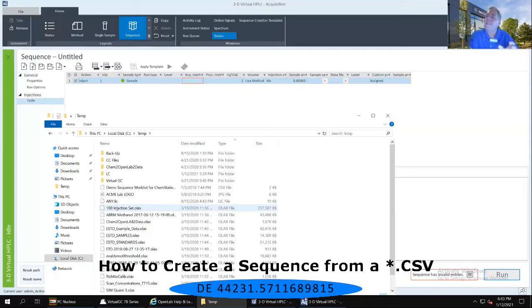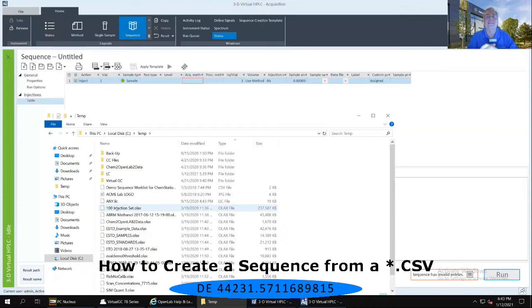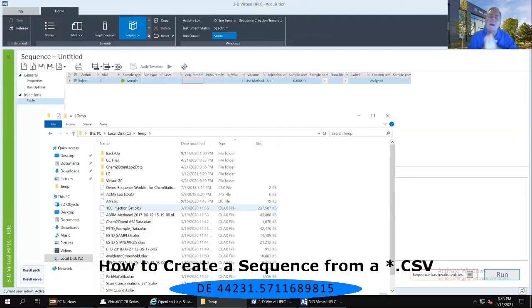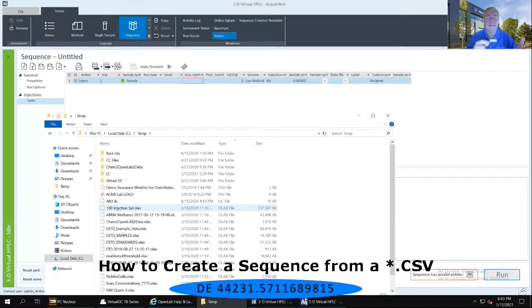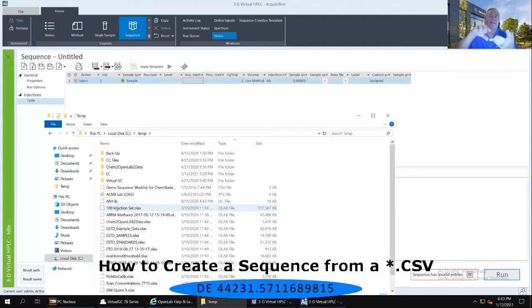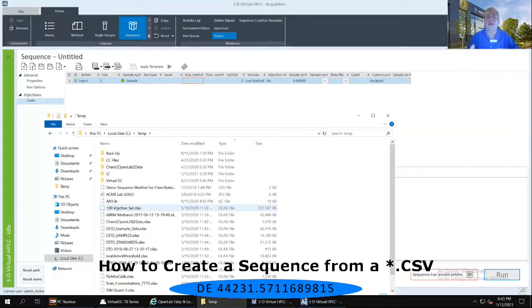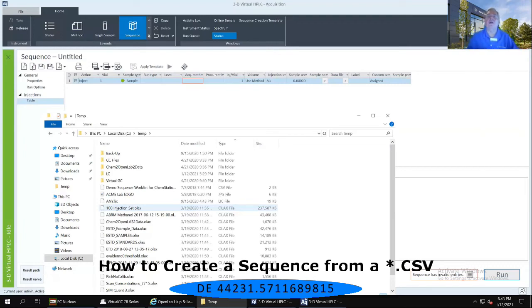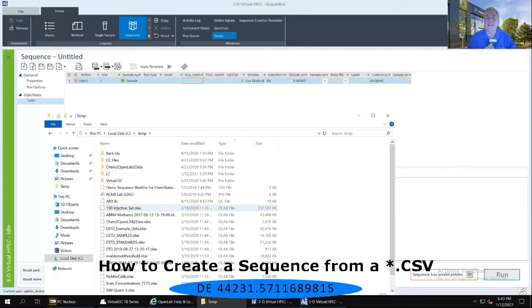I'm going to take that list, I'm going to copy it, I'm going to put it into an Excel spreadsheet, and I'm going to save it as a CSV, not as a native Excel file. The reason I don't use the native Excel file is because Microsoft keeps changing the way they save native Excel. They started saving it as a .excel file, they went to a .xls file. Now they're a .xl.xs file, and all of those have different parameters and are different formats. So instead, we tied ourselves to the CSV portion or version of file format. So you save that list as a CSV.